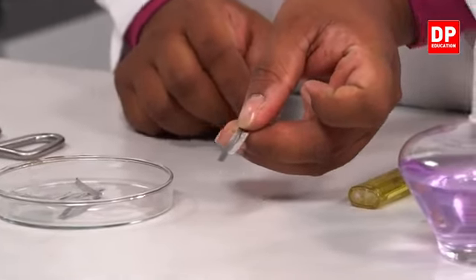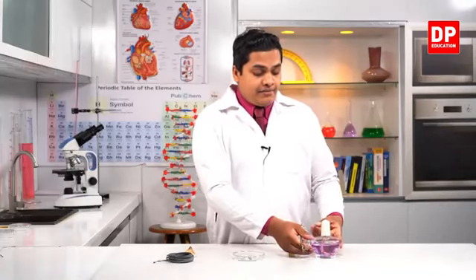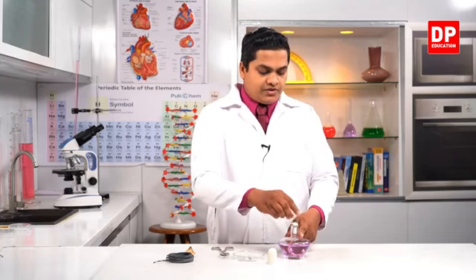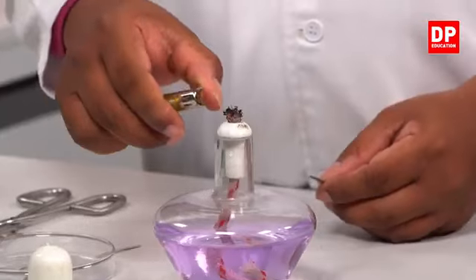So I have some magnesium strips which I already scratched using the sandpaper. Now what I'm going to do is, by using this crucible and my spirit lamp, burn this piece of magnesium to observe what kind of thing is going to happen after burning a piece of magnesium strip. So let's see whether this is a physical change or a chemical change. So let's burn the piece of magnesium to observe whether this is a physical or a chemical change.